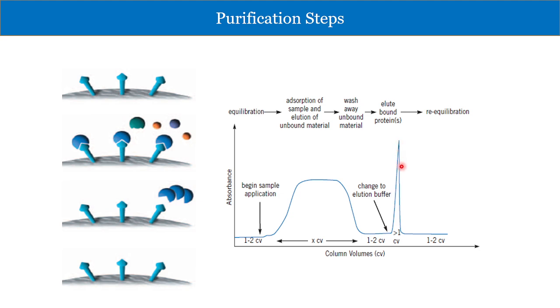You will observe a very sharp peak that is of your protein of interest. The protein you obtain after collection is very close to a pure protein, because only your protein binds strongly to the ligands, others do not. But in many cases two or more proteins can have affinity.